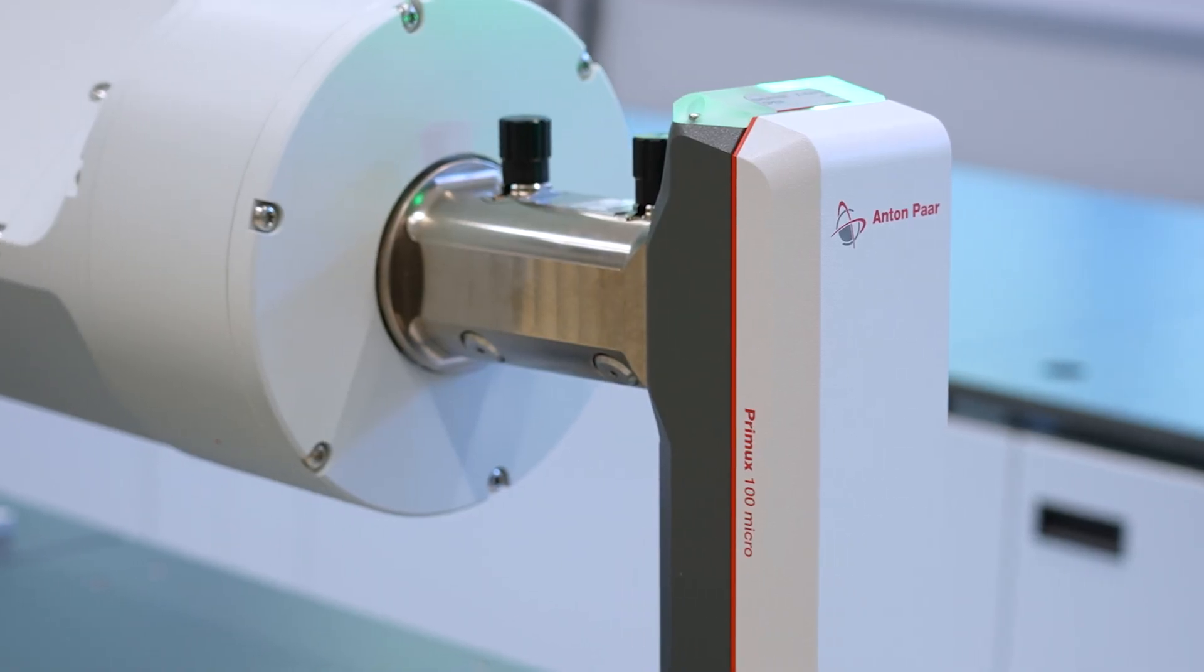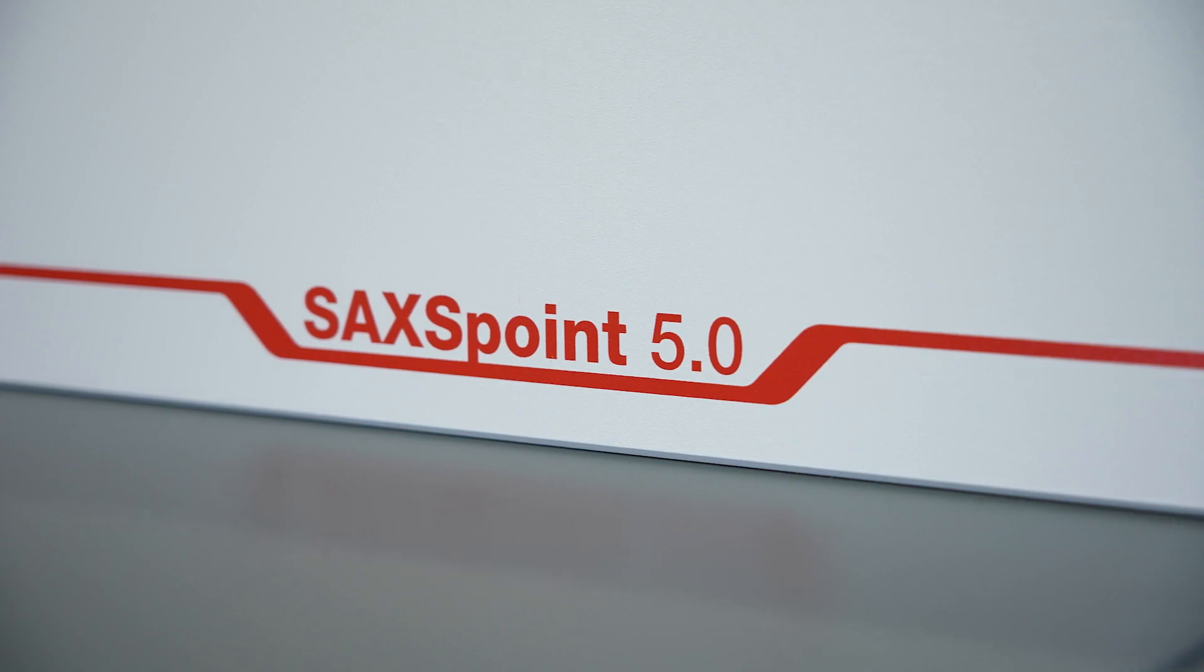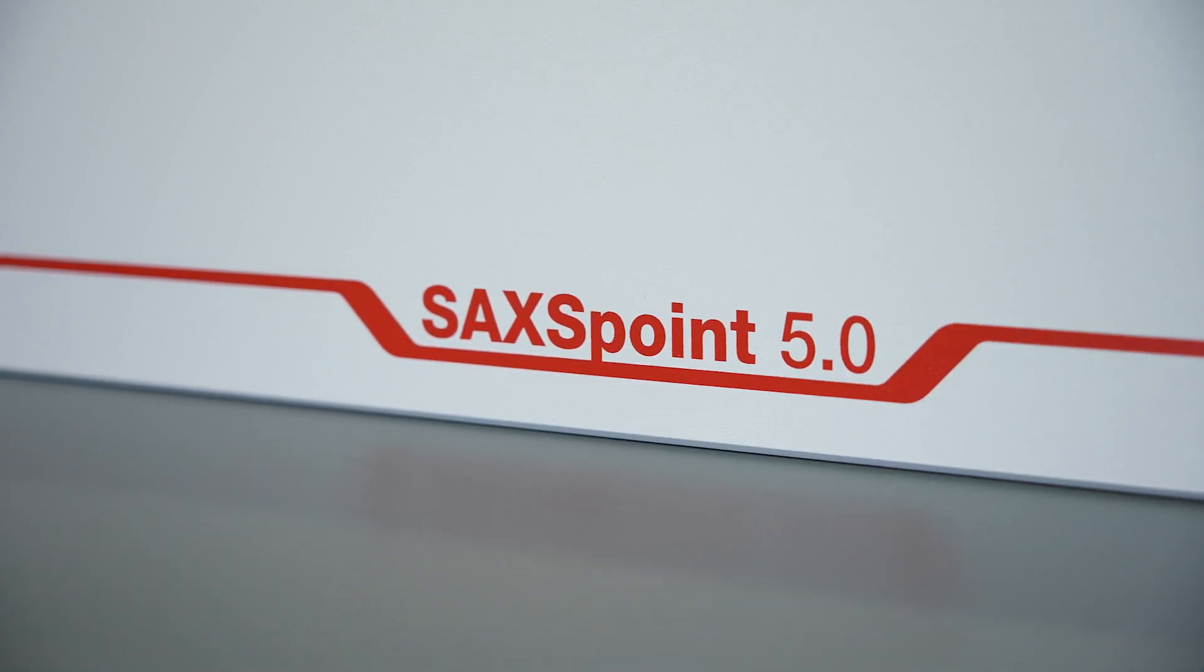We've developed brilliant, intense X-ray sources and optics for the world's most powerful and reliable small-angle X-ray scattering systems.